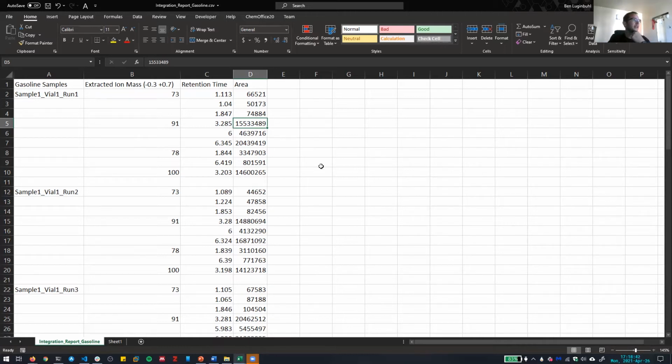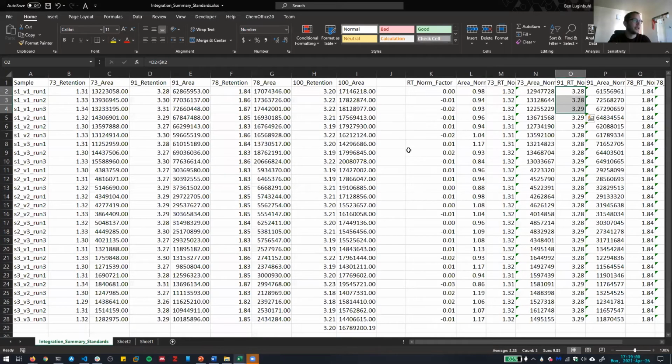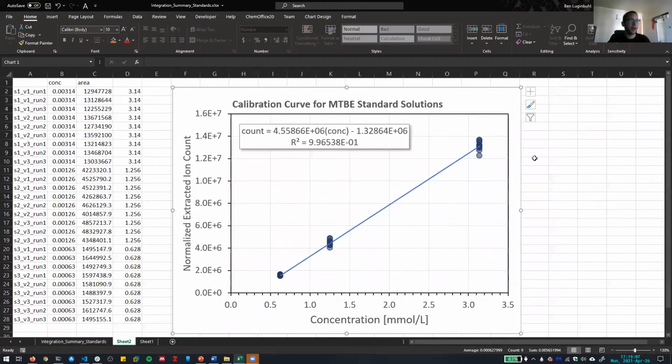Okay, I'm not going to go through the procedure for this because I want you to work on it on your own to figure it out. We didn't get this going last time, so thumbs up if you've been able to normalize the calibration data and plot each of those peaks, or even just any of them. Have you basically reproduced this plot? If you've done it for more of them, great. So no one's done it yet.